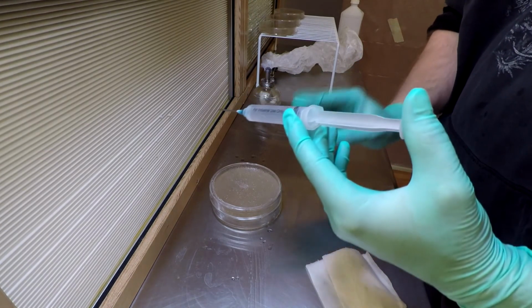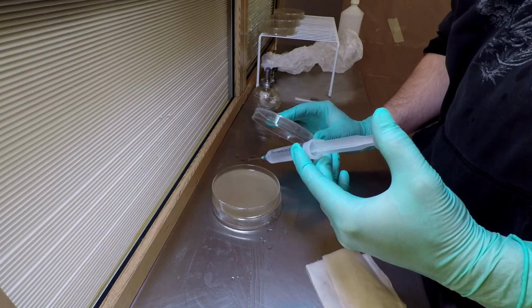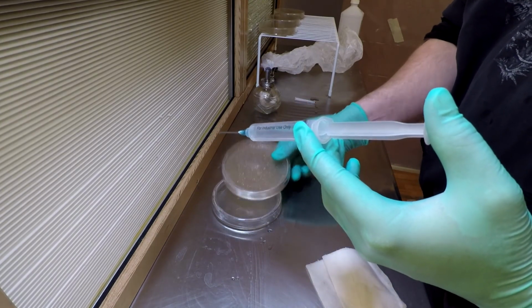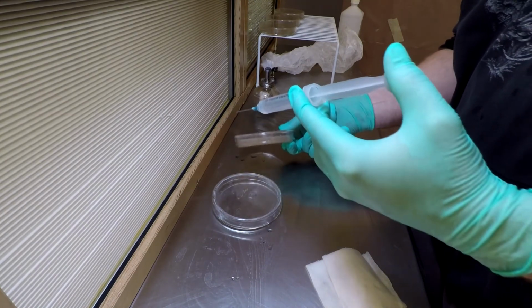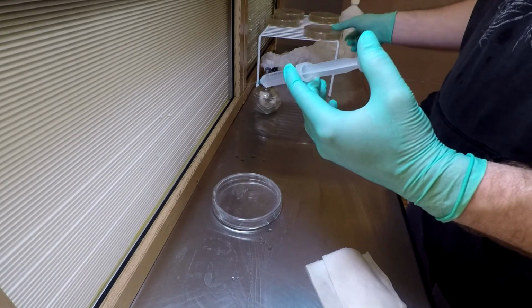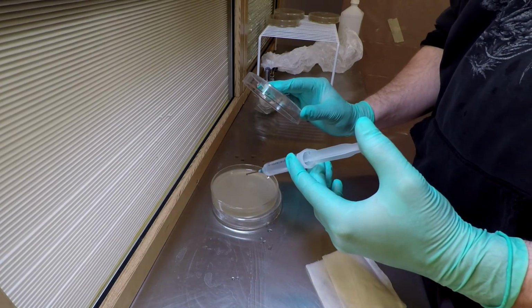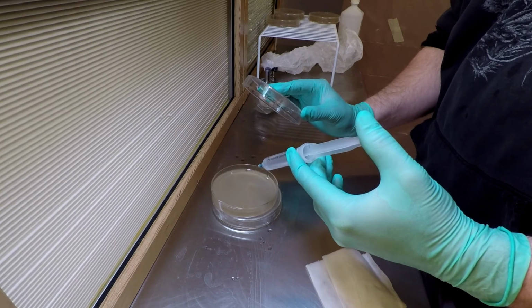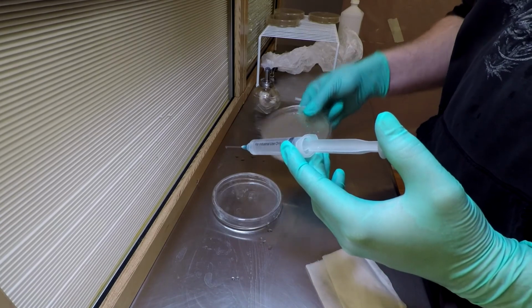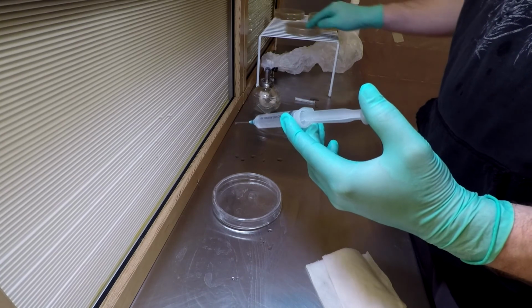Alright, this time, one drop, right in the center. Streak it back and forth. Well, I squirted a bunch in that one. I'll try to spread it out best I can. It takes a bit of finesse to just get one drop out.